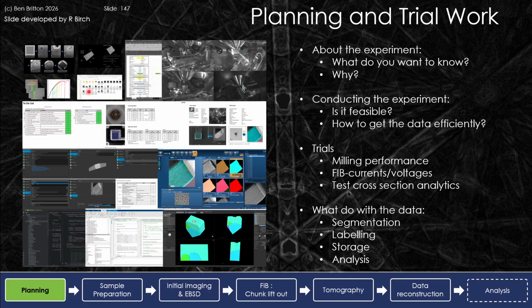One of the bits is these experiments take a significant amount of time, and you physically get quite tired as you do the experiments. And so therefore it's valuable to create simple to-do checklists to make sure that you have done each of the steps properly in turn.